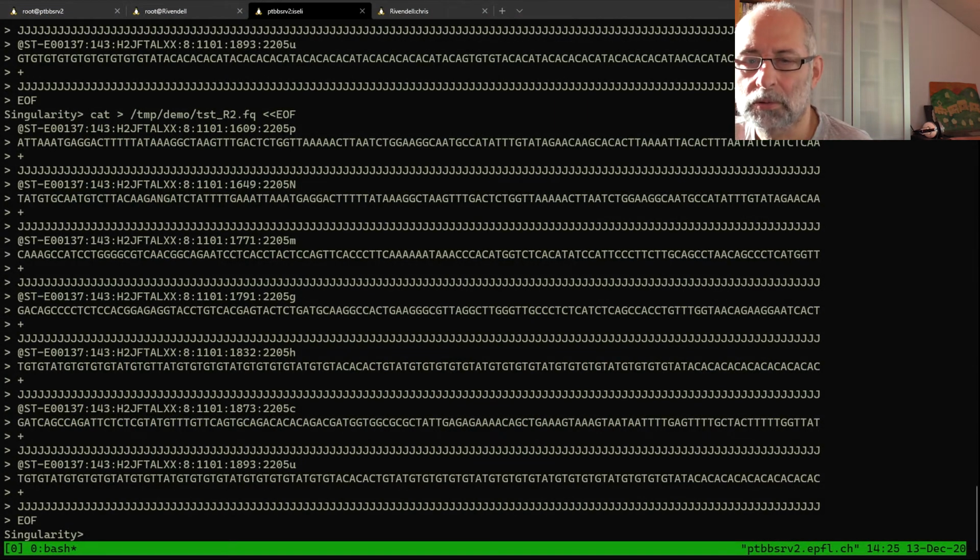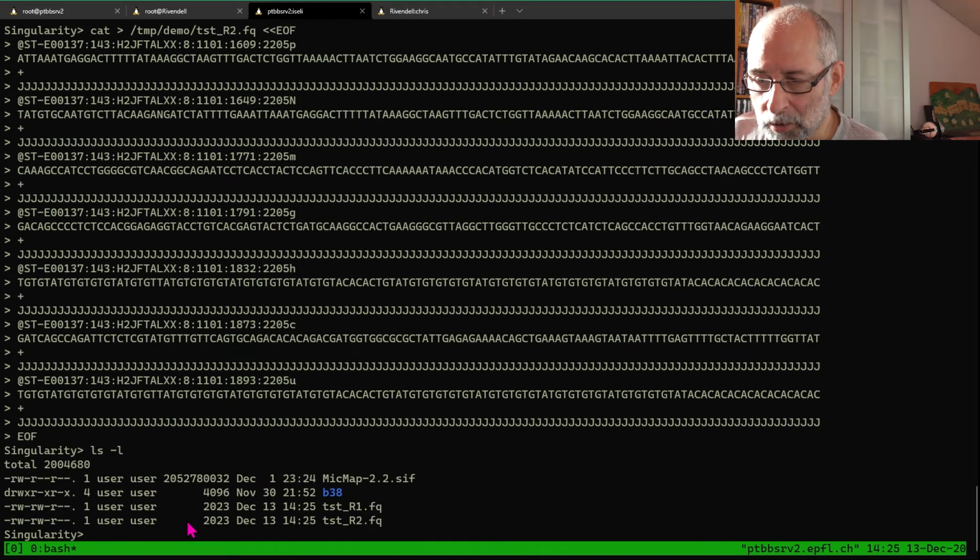Oops, forgot to switch, so I did the paste here, as you can see, and I now have those two files.